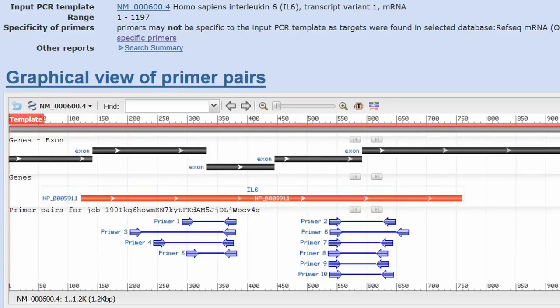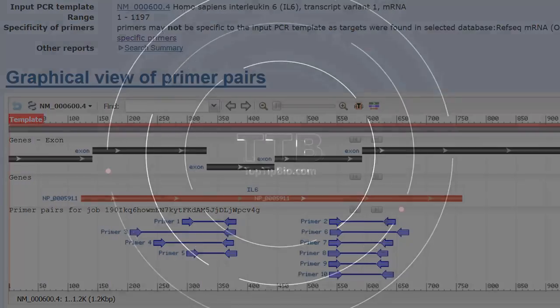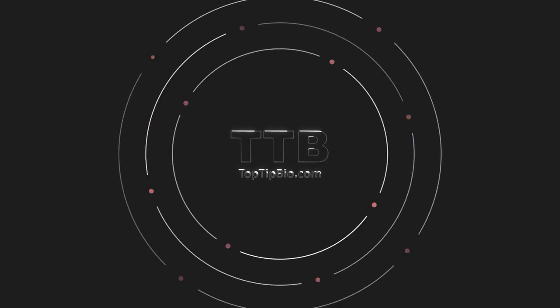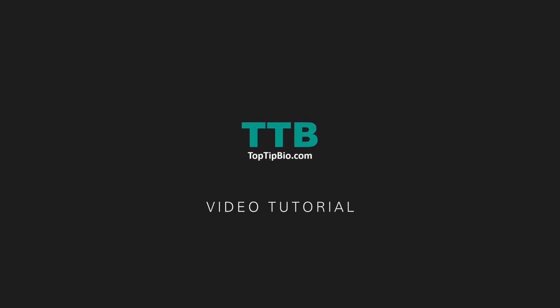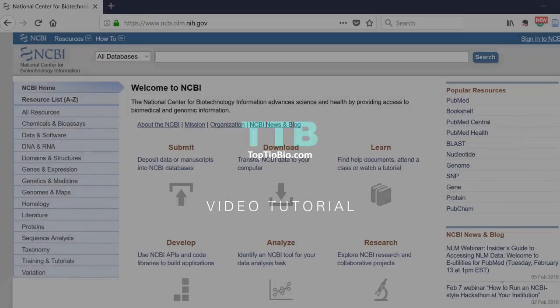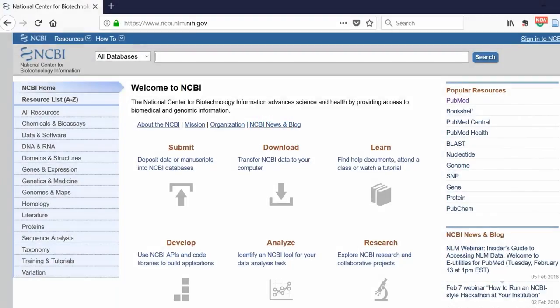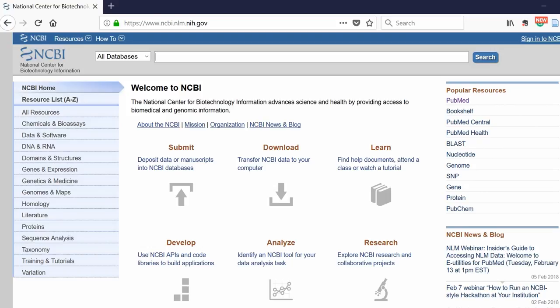In this video, I'm going to show you how to design real-time PCR primers using NCBI's Primer Blast. The first step when designing primers is to head over to the NCBI website. Within the search bar at the top, you want to search for the gene you're interested in. In this example, I'm going to design real-time PCR primers for the gene interleukin-6 in humans.